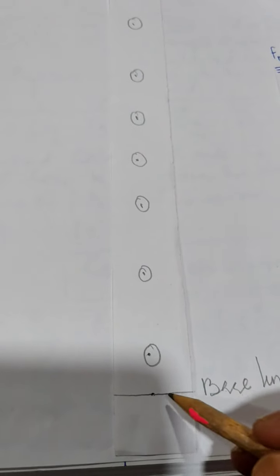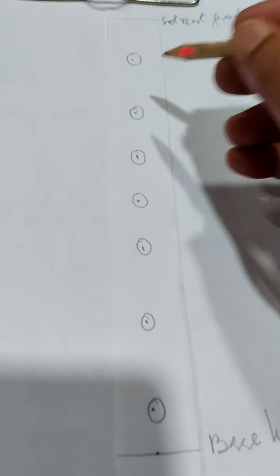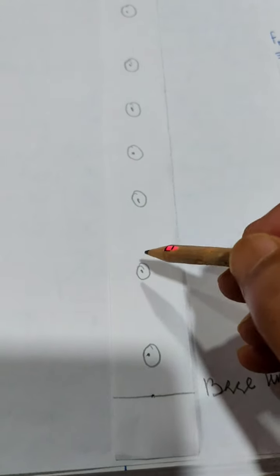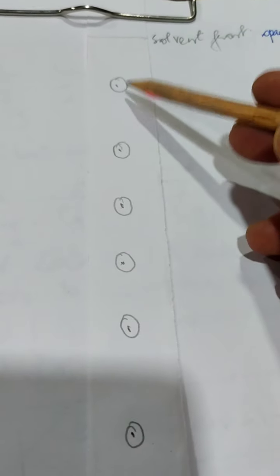Then you can see that each of these spots is stuck at a different place from the baseline. This one is nearest to the baseline, and this one is farther, this one is farther, and so on. The last one is here, nearing the solvent front.